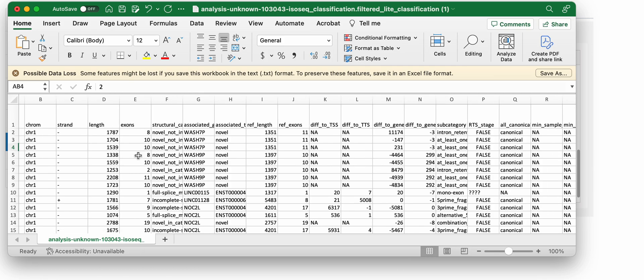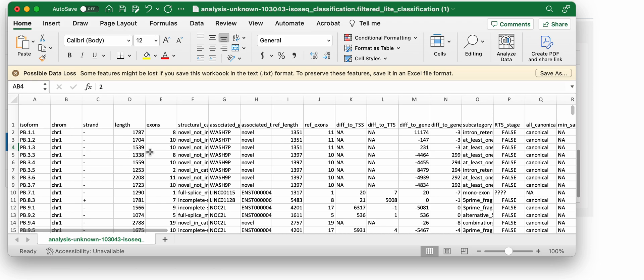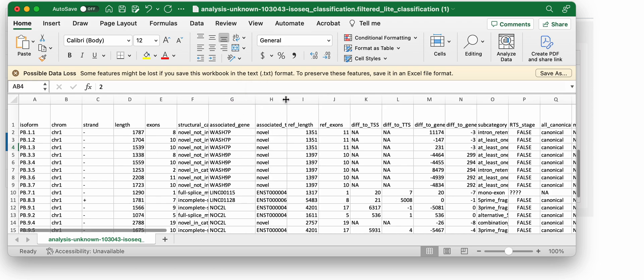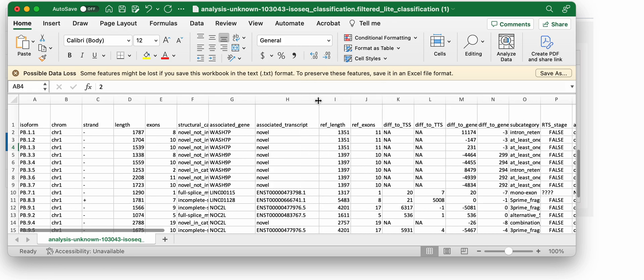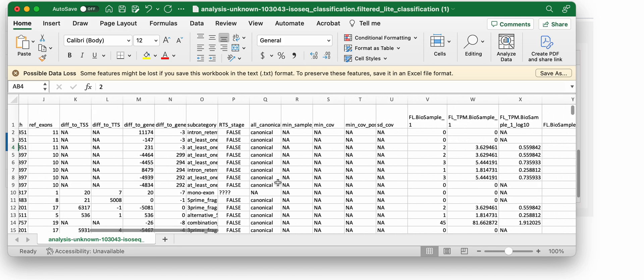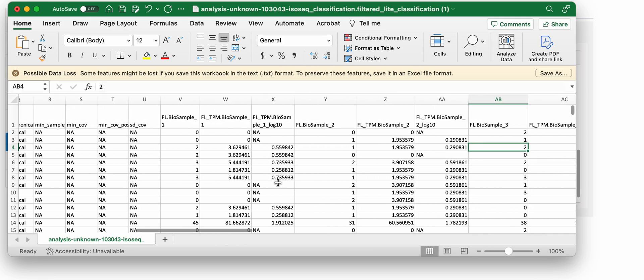This is the joint pigeon classification filter result. You can see here are the PBIDs, the associated gene and transcripts.